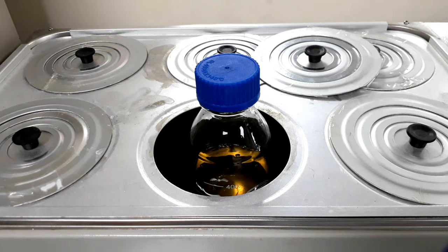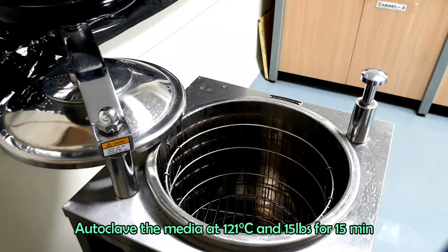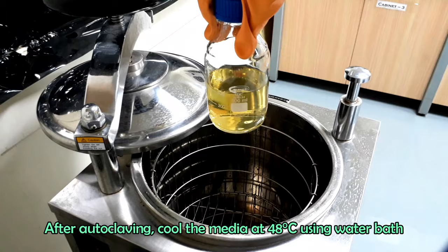Now boil the content in a water bath for 5 minutes. Take the boiled media out of the water bath and place it into the autoclave. Autoclave the media at 121 degrees Celsius and 15 pounds pressure for 15 minutes. After autoclaving, cool the media to 48 degrees Celsius using a water bath.